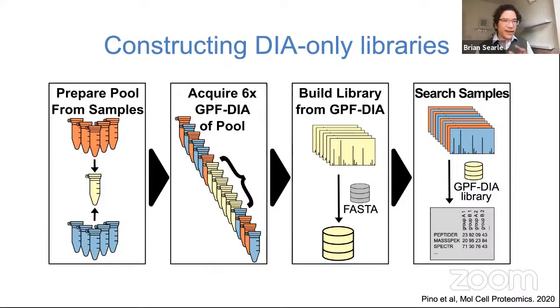That said, if you have two very disparate types of experiments, for example, one experiment I was doing was looking at CSF from two different types of sources. One is from a lumbar source and one is from a ventricular source. These are whether you collect it from the base of the spine or from the back of the head. Because of the difference in the type of matrices, they have very different types of proteins. So because of that, we actually oftentimes will acquire two different libraries, one for the lumbars and one for the ventriculars. So that's a fantastic question.